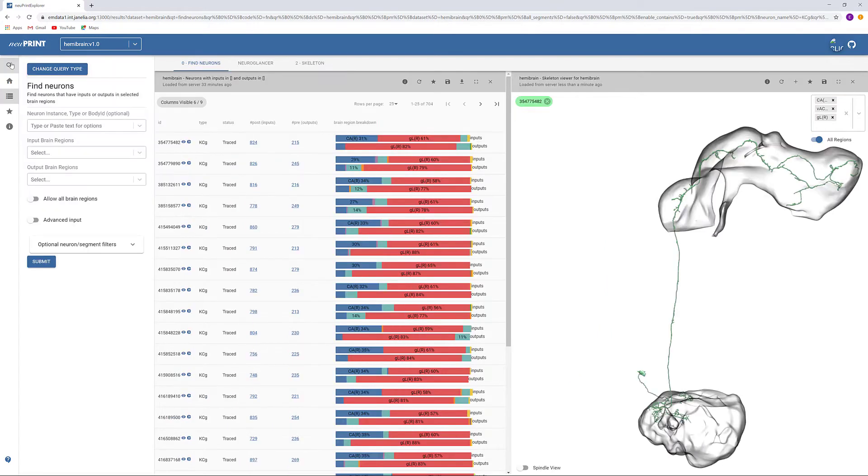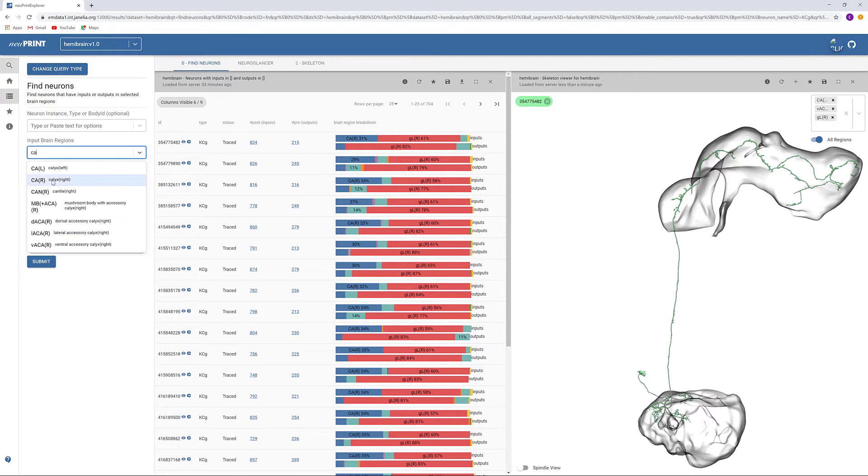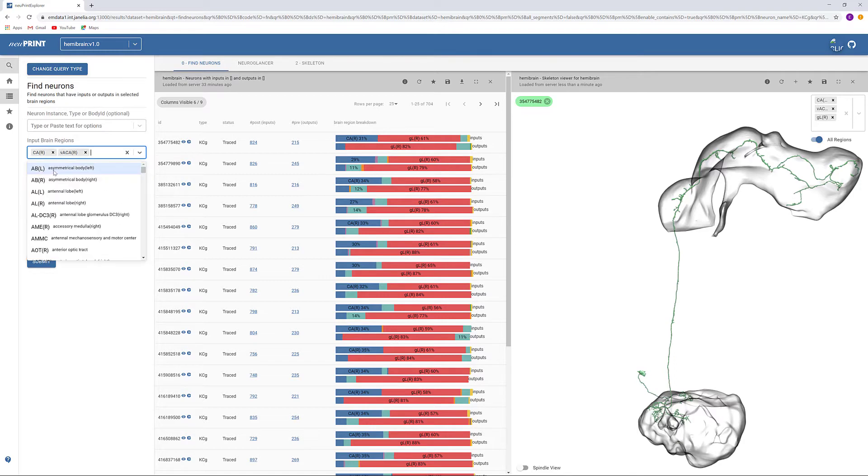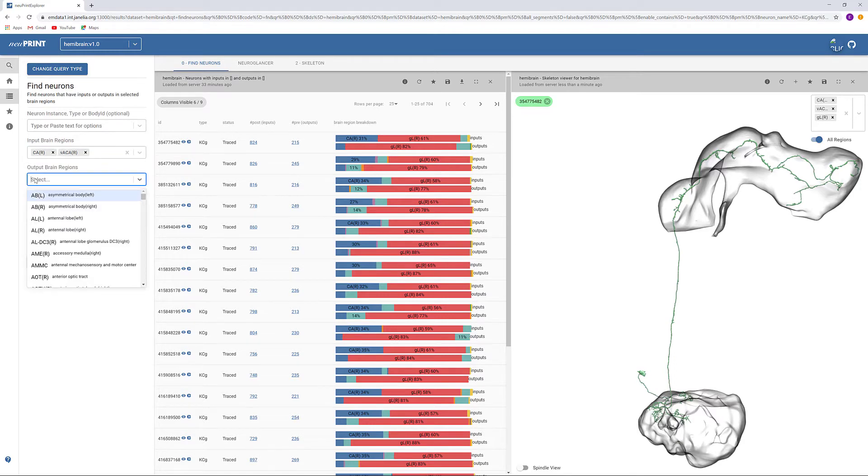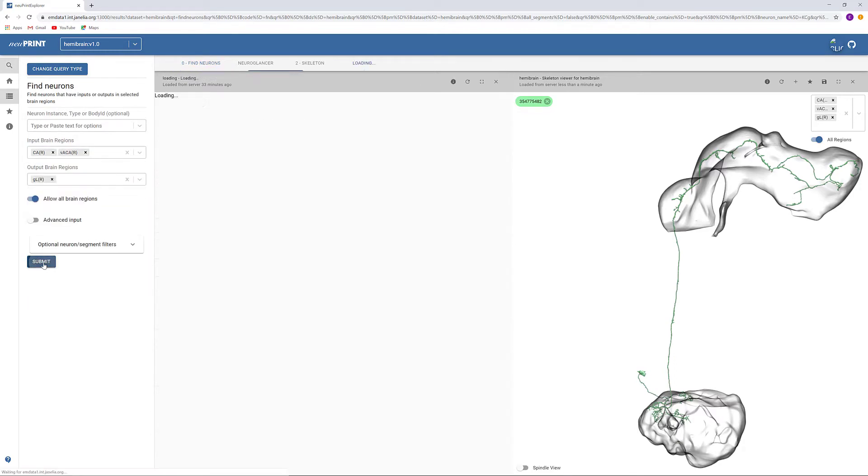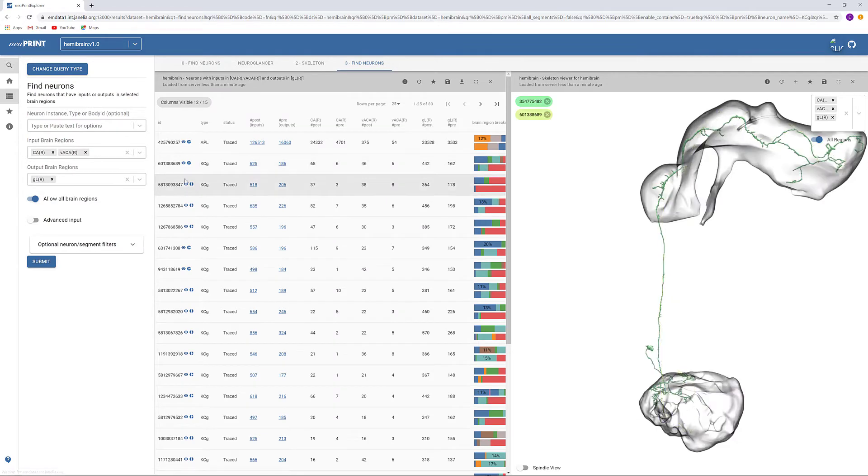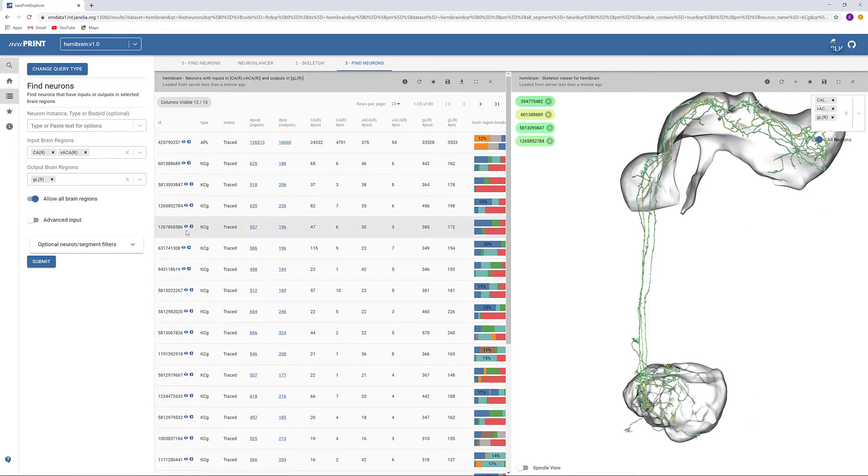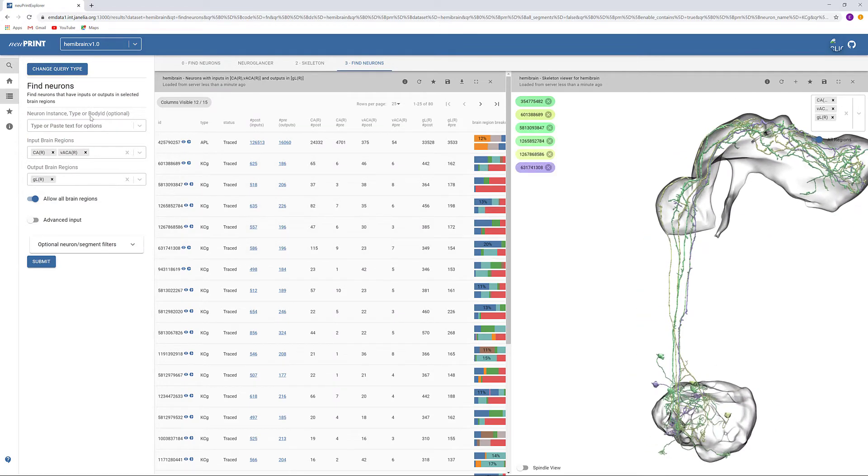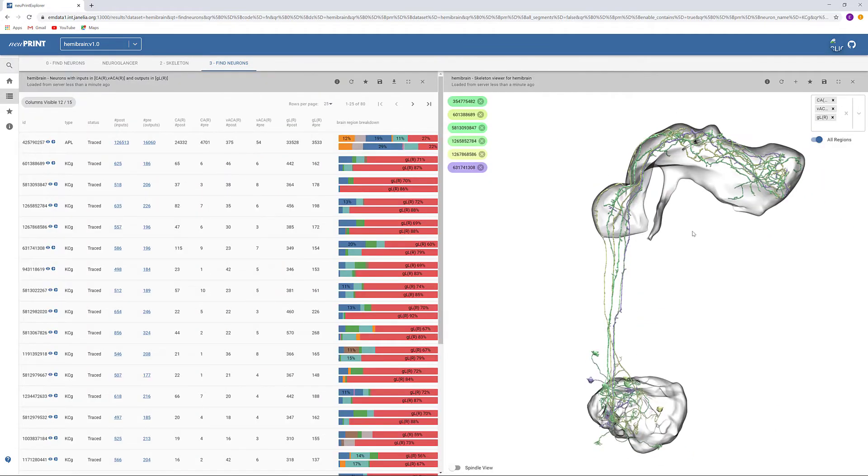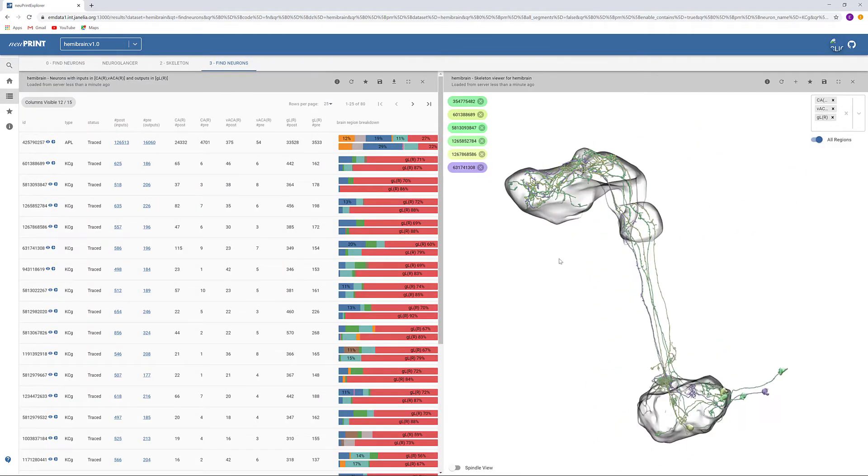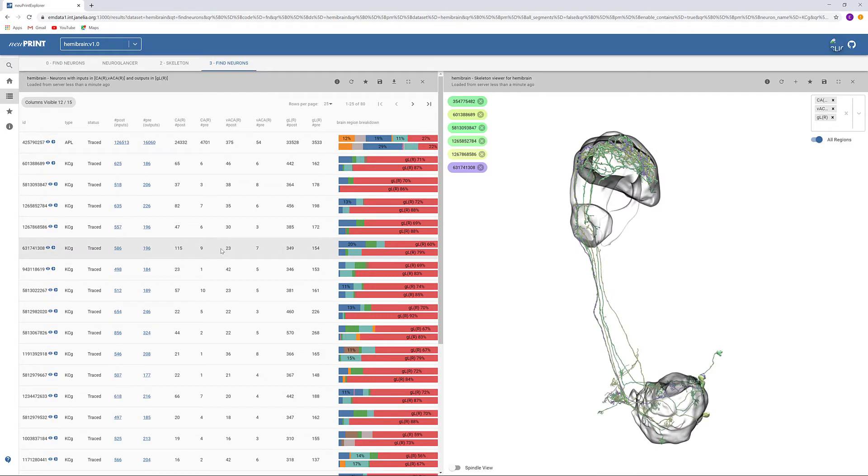You also have the option to start out your search with the input and output brain regions directly. The result is a list of KCGs as well as some other neuron types that have input and output here.